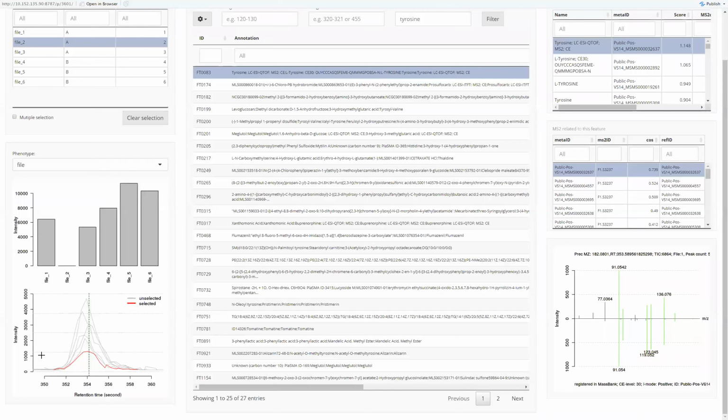And then we can click on the bars. Maybe we can now click on the highest bar to see which chromatogram it corresponds to. Actually, we can see the highest bar corresponds to the highest chromatogram. So the intensity here I think is okay.